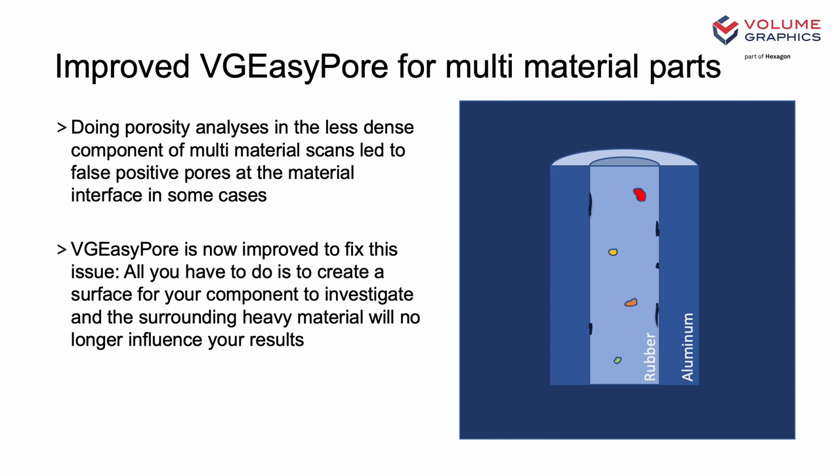Finally, using VG EasyPore on multi-material parts historically can be a little challenging under certain circumstances. If we were looking for porosity within a less-dense component of a multi-material dataset, sometimes we would end up with false positives in the areas where the materials interface each other. So we've taken a closer look to try and fix this issue. Now, provided the less-dense material has a surface already defined, we will no longer get the false positives at these interface areas. Just run VG EasyPore as normal.